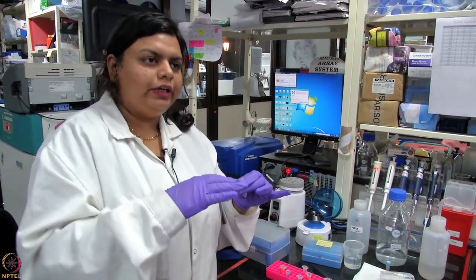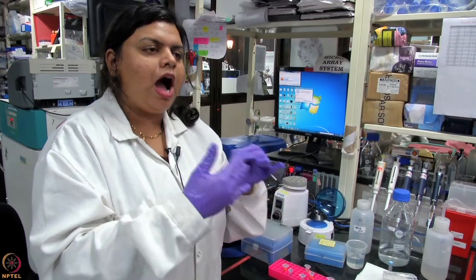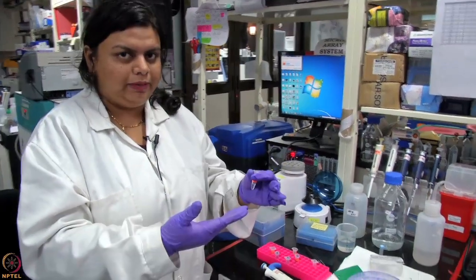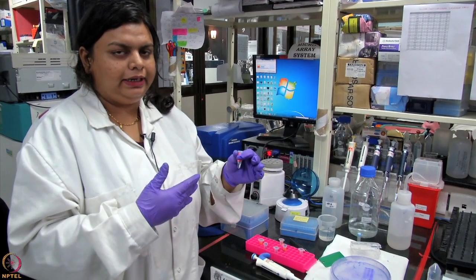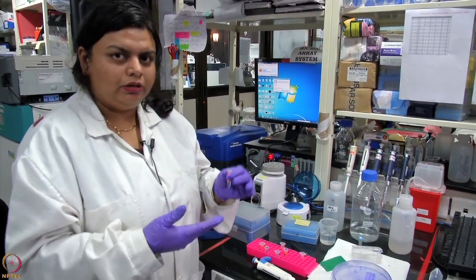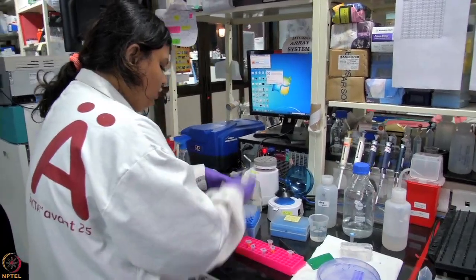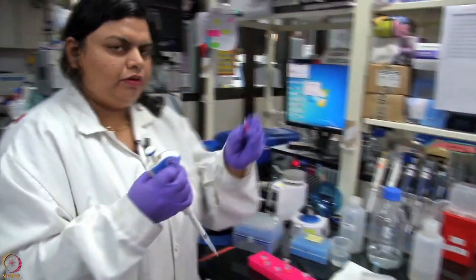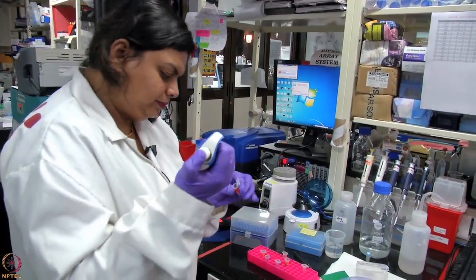So according to the protein that you want to select, you need to optimize how much time you want to keep this binding solution. You can go either for an overnight binding at 4 degrees or you can do a binding for 2 to 4 hours depending on your experiment. So now we will add the antibody to the activated beads.